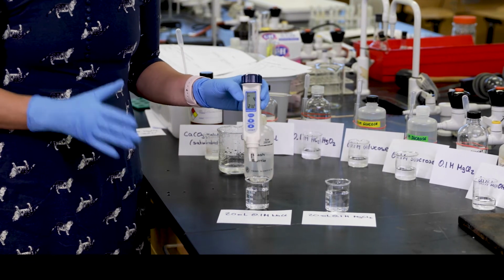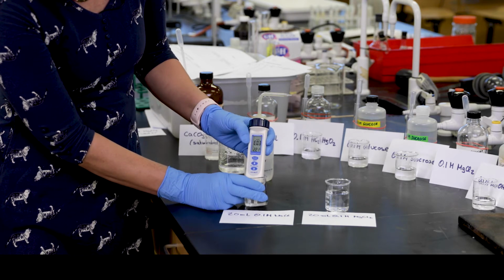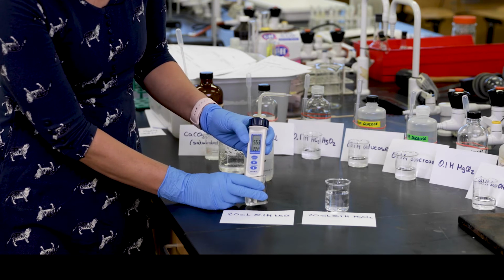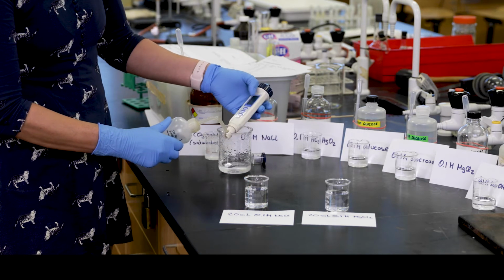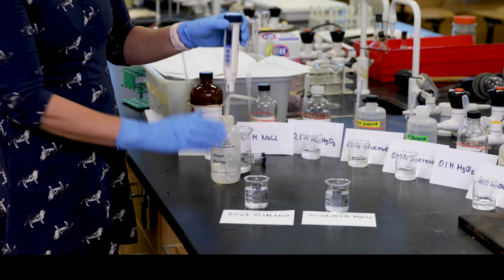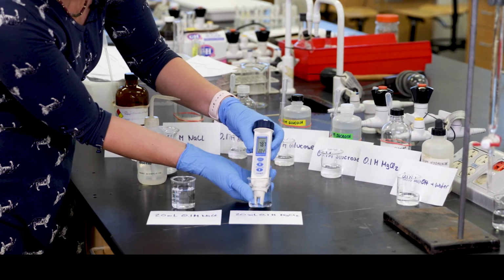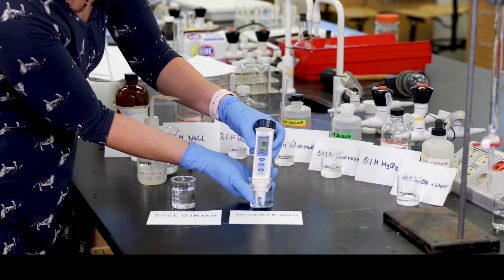So sodium chloride was around 10 millisiemens. Let's see what it is now. Aha! It's now at 5.53 millisiemens. Let's see what happens in the other solution. So there was about 15 to 16 millisiemens. Now we're going to add that here. And it's now at 7.88 millisiemens.